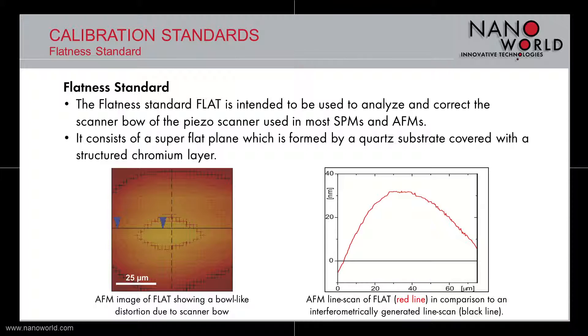On bottom right you can observe the comparison between an AFM line scan of the FLAT calibration standard with its bow-like distortion, which is shown in red, and an interferometrically generated line scan shown in black.